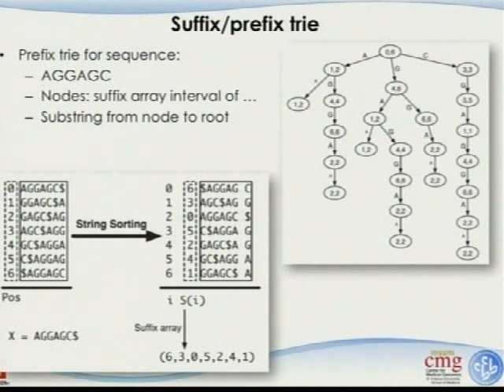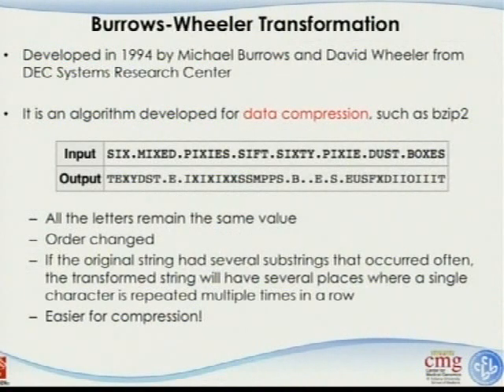Well, for the Smith-Waterman, as you can imagine, for every sequence alignment, what I have to do is generate this big matrix and do the backtracking. And that's not going to happen, especially when one of the sequences here is the reference genome, which is 3 billion letters. But for the suffix prefix tree, doing this searching is extremely fast.